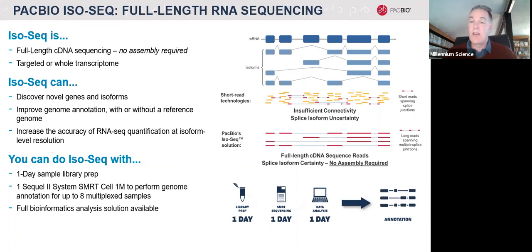And because it's single molecule sequencing too, you're essentially getting a digital count as well of the expression differences between the different isoforms. So if something's at 90% of all the isoforms compared to something else at only 10%, then you see those differences in sequencing terms too. So now I've talked a little bit about the diagram up there. I suppose I'll just run through the notes here.